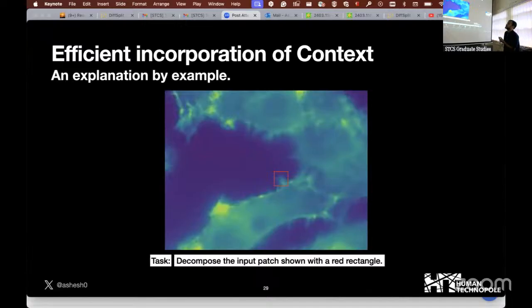So let's say you have this. So the question now in image decomposition is, you're taking all the image and now it's a software problem of trying to decompose the things. Right. So from the microscope, we will get a superimposed image, and from there we want to split it apart, right? So for the first two works that I will present, the input will be simply a sum of the two structures. Later, I will show you results where we have actually imaged superimposed structures directly from the microscope.